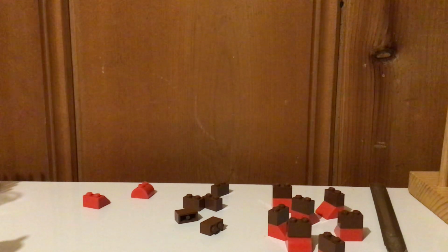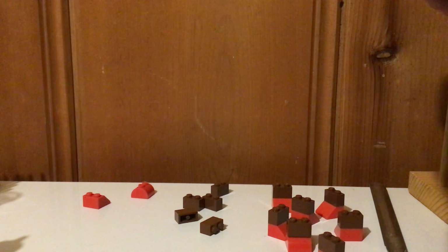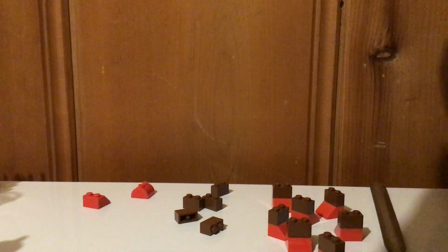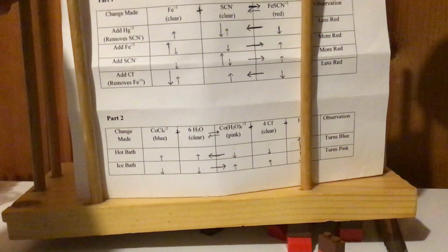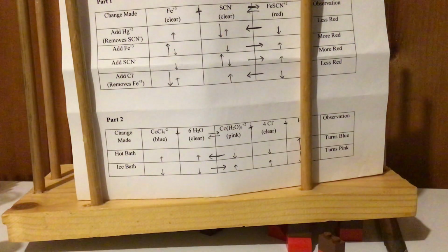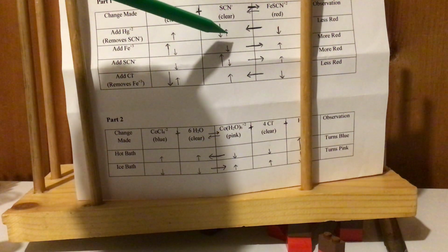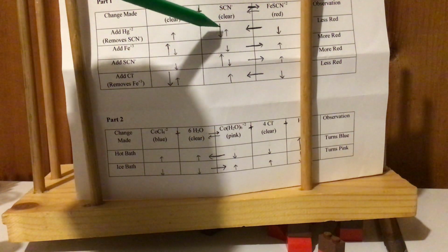Okay, so now let's just look at one more case right here. And what if I take away some SCN minus? Let's take a look here and bring this back. Okay, we're getting a little unbalanced here, but let's say I add Hg, which removes SCN minus from the system. So what if I remove SCN minus?